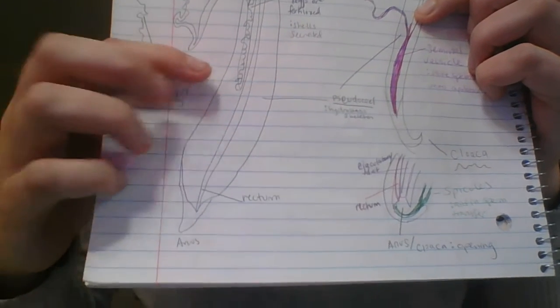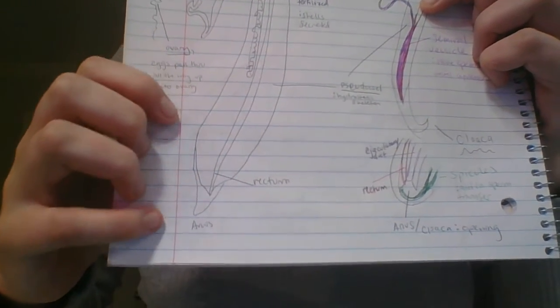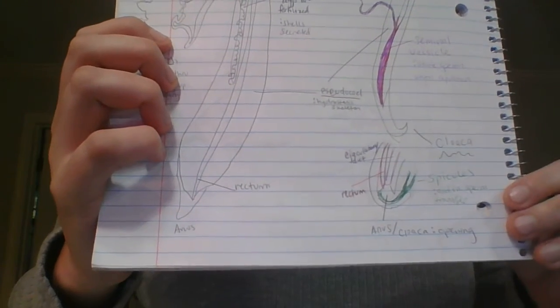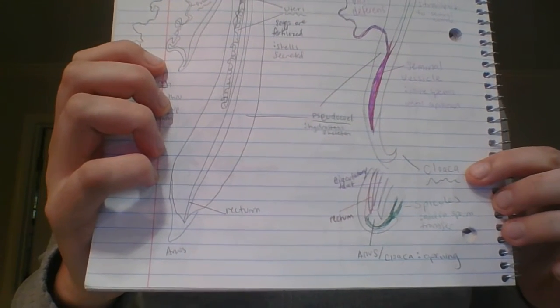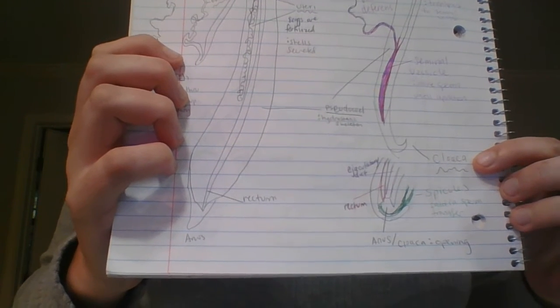But yeah, the anus is the first time we see a difference between male and female. The rectum empties into the anus. This is where it's excreted. The males actually have this thing called a cloaca. This is a common cavity at the end of the digestive and reproductive tracts.